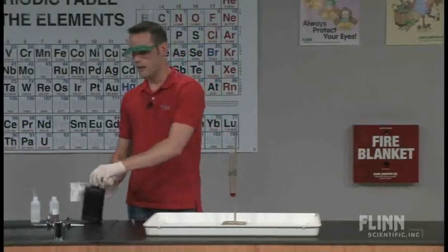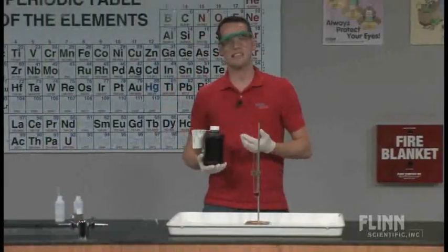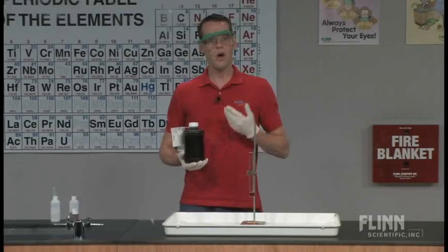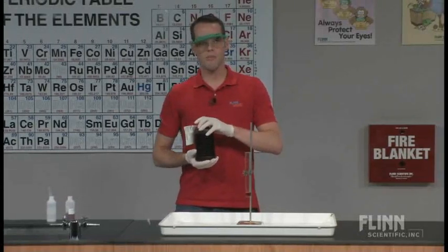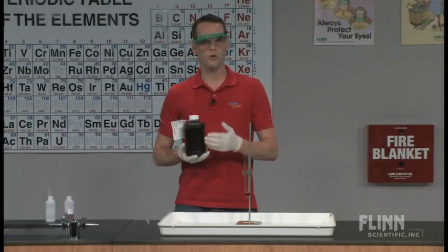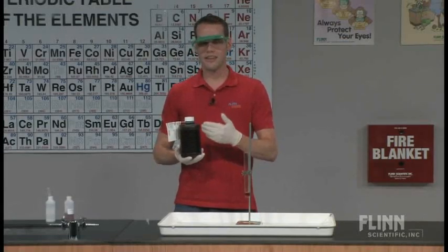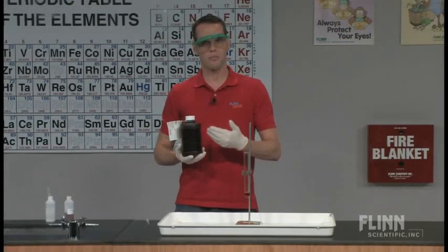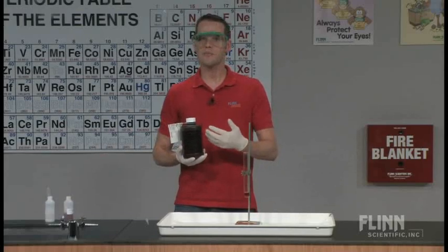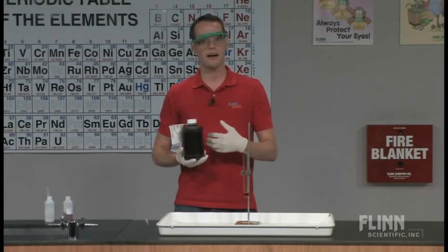Now another thing that's interesting, lots of things can catalyze the decomposition of hydrogen peroxide. One of them is ultraviolet light. So you'll notice that most manufacturers, when you buy it in the store or if you buy it from Flynn, you'll see that they come in these very opaque dark brown plastic bottles. This keeps the ultraviolet light from getting into the hydrogen peroxide.